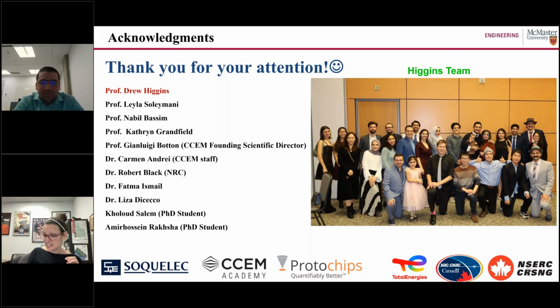Okay, I understand. Thank you. And then we had one more question here, and then if Sanjay is ready, we can definitely move on. So the use of the dose software was really interesting and intuitive, but being a new TEM user, how does this software compare to what was done before for recording and reporting electron dose? What was the process like for recording dose before the software, and how has the software really helped you? Is it really that important?